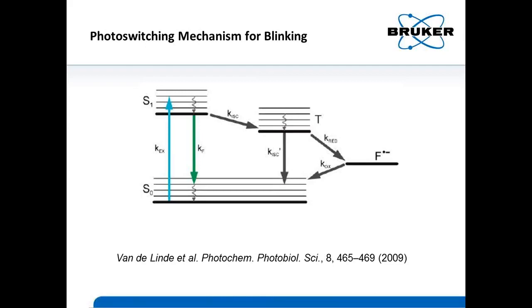So if you're looking at it as a very traditional fluorescence mode, you're essentially exciting the molecules from the ground state to a vibrational state, but that essentially relaxes really fast. That's the order of picoseconds, and then you can emit it back to the ground state. So that's the order of nanoseconds. So that happens very, very fast.